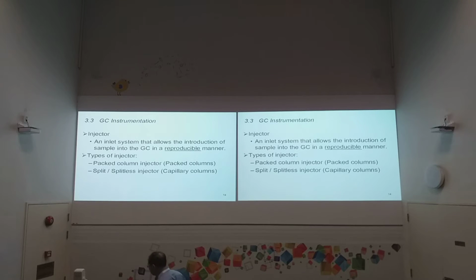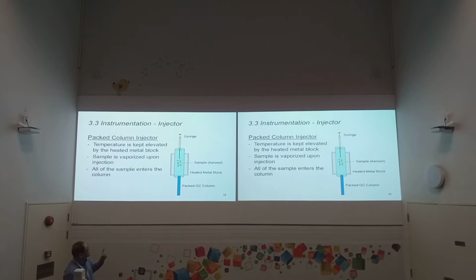So if you see the design of the injector, there's a diagram of a simple injector. Actually, the injector is just like a small container. But outside, usually there's one layer of jacket, right? Actually, it's a heater.